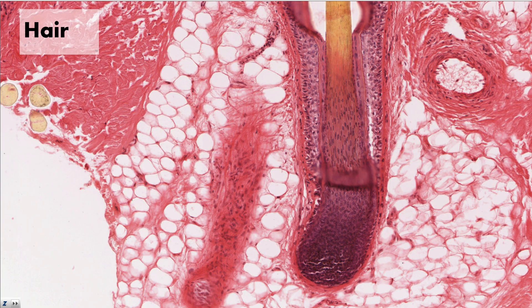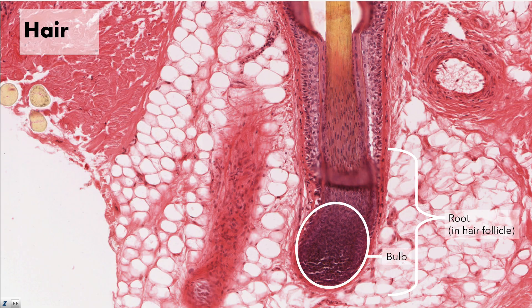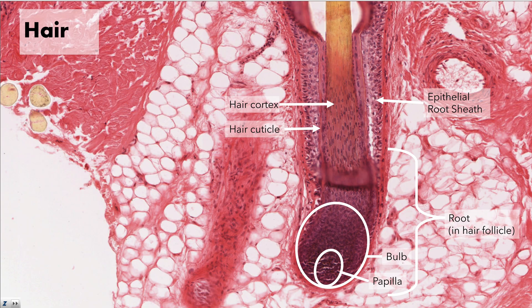Human hairs extend from deep inside the reticular layer of the dermis to outside the integument. This image focuses on one hair follicle, the deepest portion of the hair. The root of the hair originates in the hair follicle. The end of the hair forms a widened bulb that contains a hair papilla. The papilla contains stem cells and a capillary network to deliver nutrients. As hair cells grow out of the bulb, they form layers. The cell nuclei form the hair's cortex, and surrounding the cortex is the hair's cuticle. The hair is in a shaft composed of a root sheath made of two layers: the epithelial root sheath, which is a non-keratinized stratified squamous epithelium, and the connective tissue root sheath, composed of dense irregular connective tissue to hold everything together.